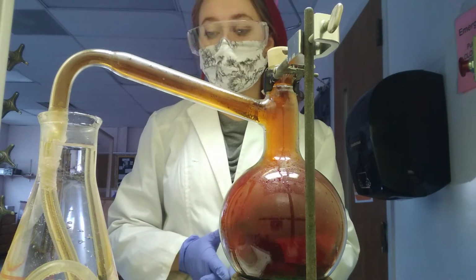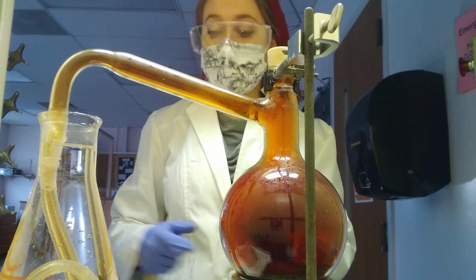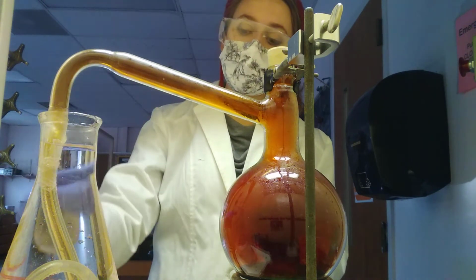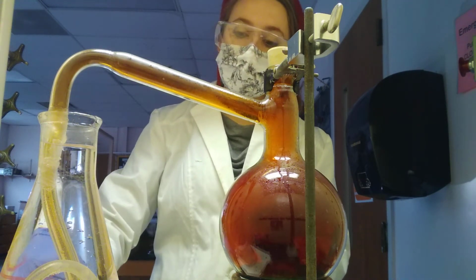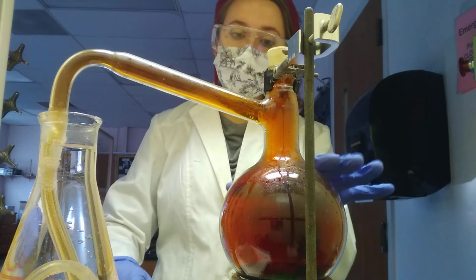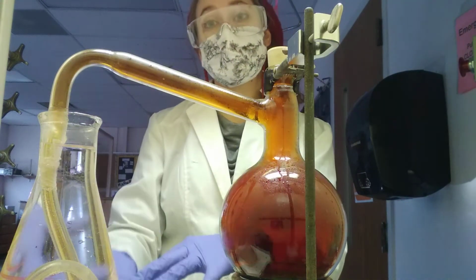So I want to describe to you something that I can see, and I'm not sure you guys can. We are noticing that before, this brown gas was bubbling all the way through the hose. And it did that for a while. Particularly as this warms up, it is going to be pushing the gas this direction.